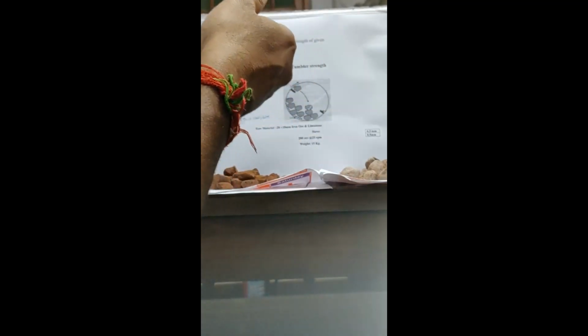When you open the hinge, the two plates separate and the material falls down. Below is a thick steel plate, and the distance between this thick steel plate and the bottom from which the material is falling is 2 meters. So we are dropping the material from a height of 2 meters, which means we are subjecting the raw material to impact force. Due to that impact force, the material will break.